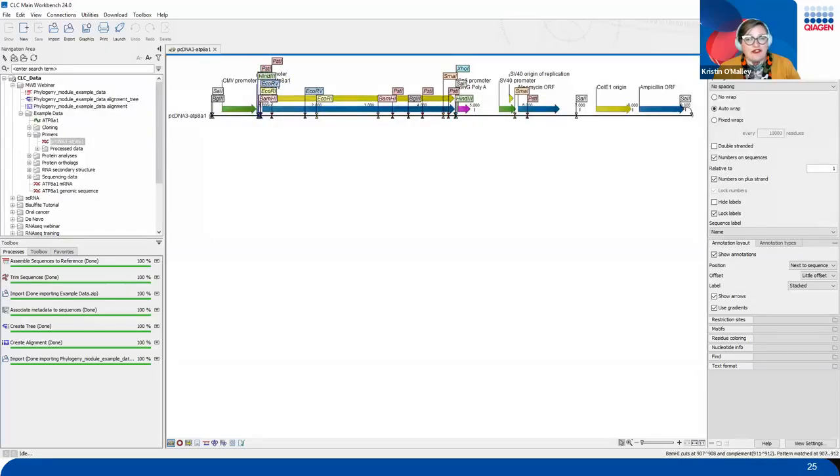If these flags are overlaying important information, you absolutely can shut some of these restriction enzyme flags off using our sequence settings to visualize exactly what all these sequences are behind the scenes. But trust me, the actual insert sequences are there in the yellow and the blue, as well as all of the important bits that come with this insert itself.